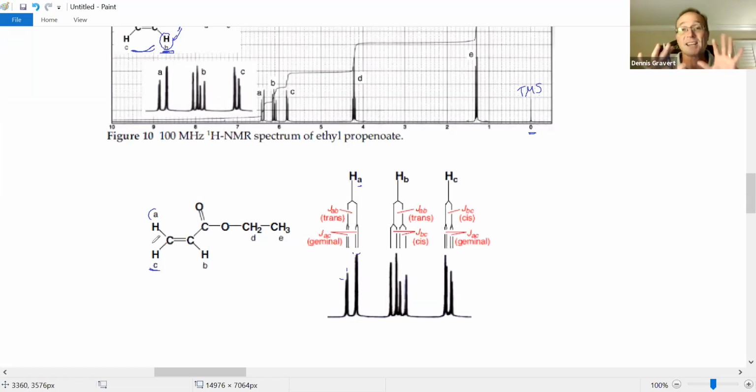So to reemphasize, I'll just go even stronger. I will not put an alkene on the hydrogen NMR problem. There's one in the homework, I believe, just so you see it. And for the future chem majors who may encounter this, at least you've been exposed to the idea. Okay, probably said way too much. We don't have to overanalyze this. I just want to mention for those chem majors, these are called little, what do they call this? Splitting trees? I forget what they call it. But it's a way to analyze the data. So what's going on here? Oh, and there's the J coupling constant notation.